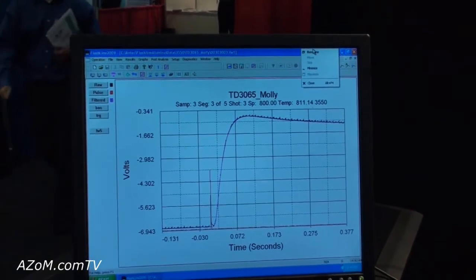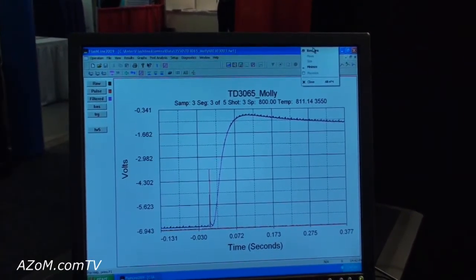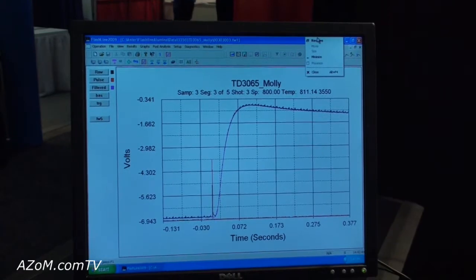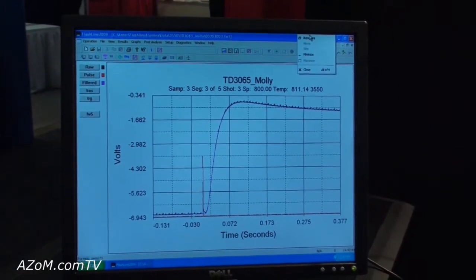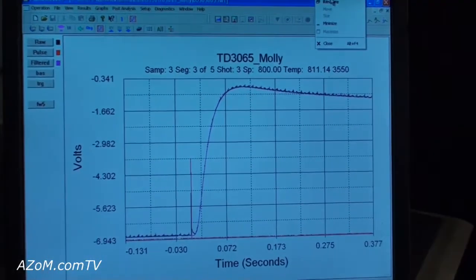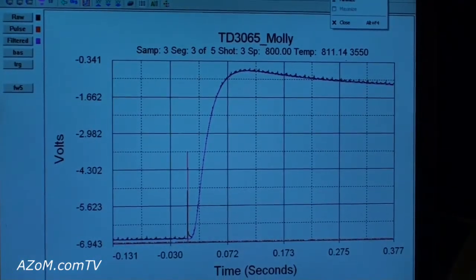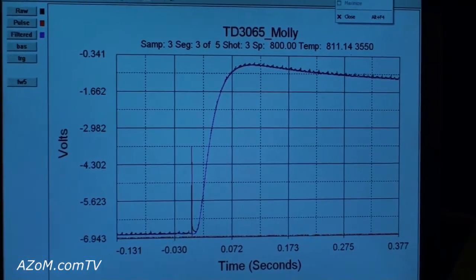You'll see it's voltage versus time but that's actually converted to a temperature. The relative change is what's most important and the half time to get there. From that, you determine the thermal diffusivity.